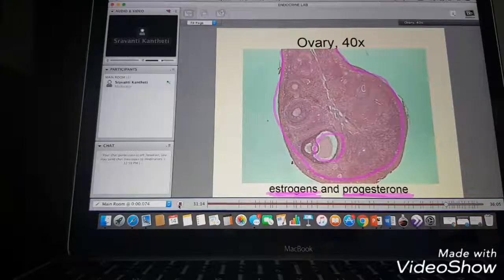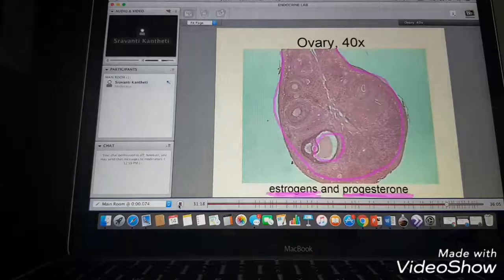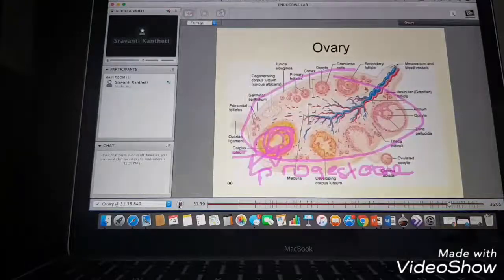So this is that same area. See that corpus luteum? That's that area where the egg spewed out. Well, the egg's probably going over here into the fallopian tube. And for 2 weeks, this will stay like this and continue to produce progesterone. But if that egg does not get fertilized, it shrivels up and it becomes, is it on here? The albicans.